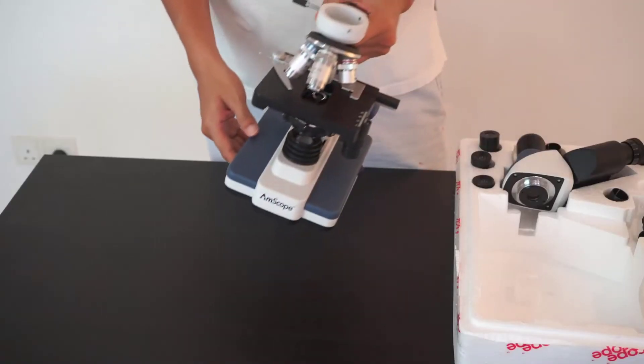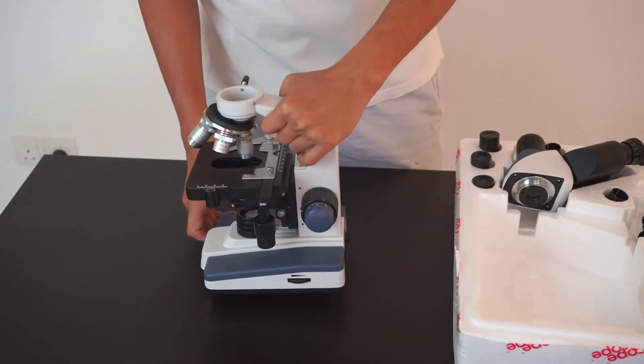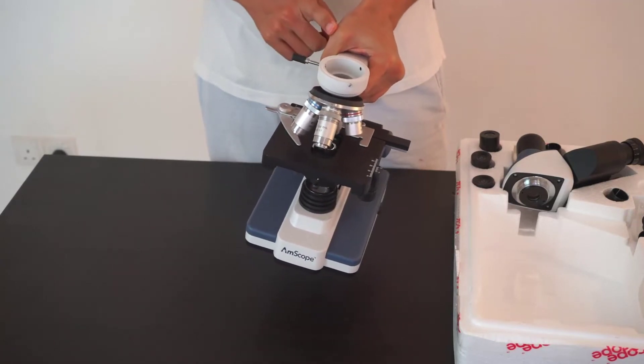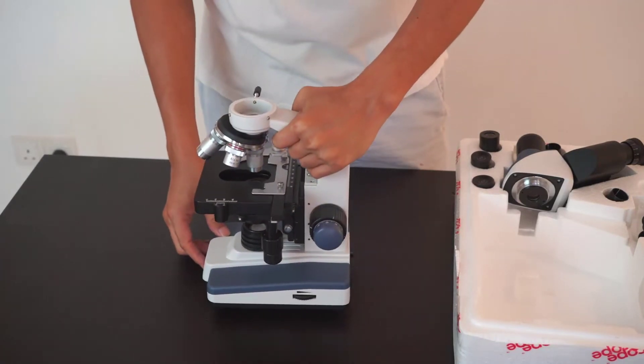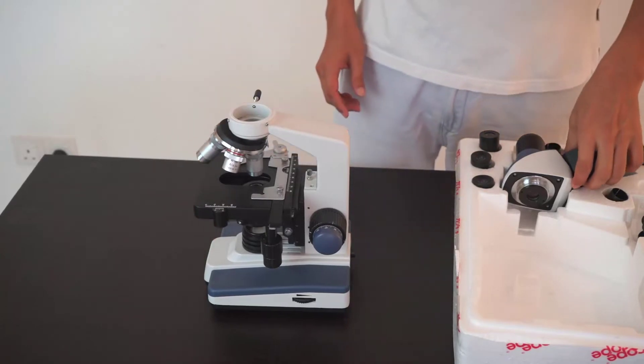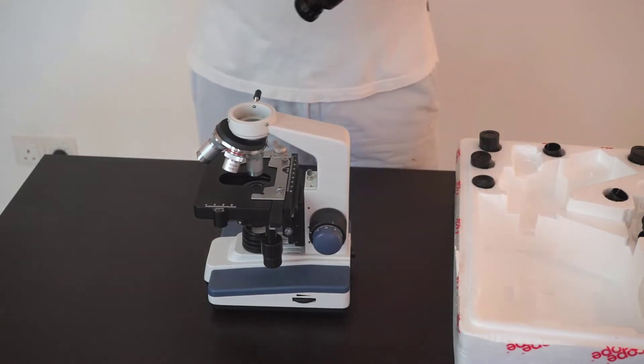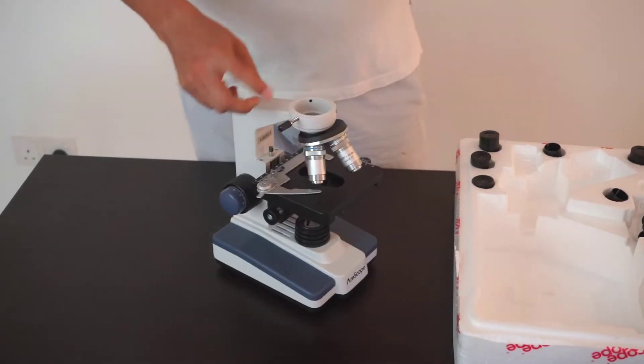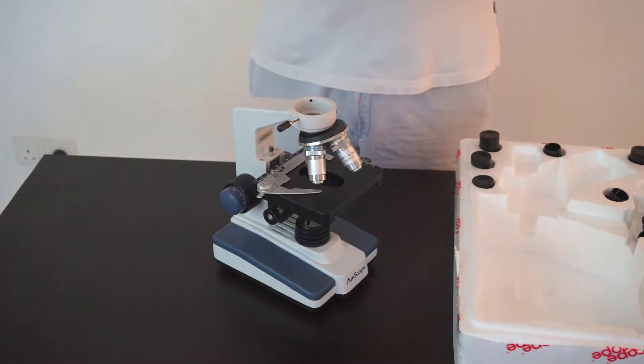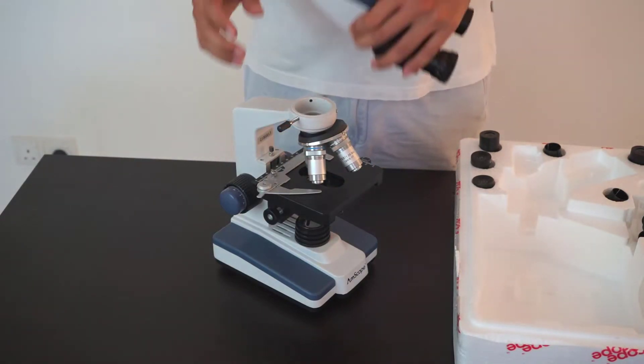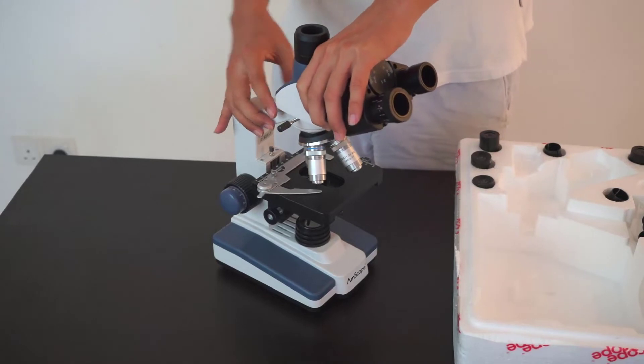This is the body of the microscope. To hold the microscope, make sure you're holding the neck. Next we have the binocular head of the microscope. To mount it, look for the pin here. You can unscrew the pin and put in the trinocular head of the microscope.